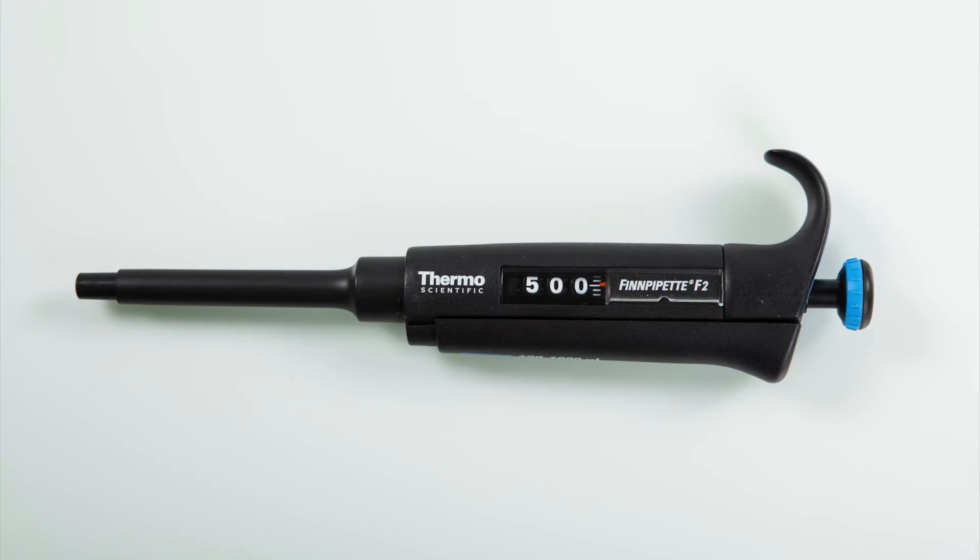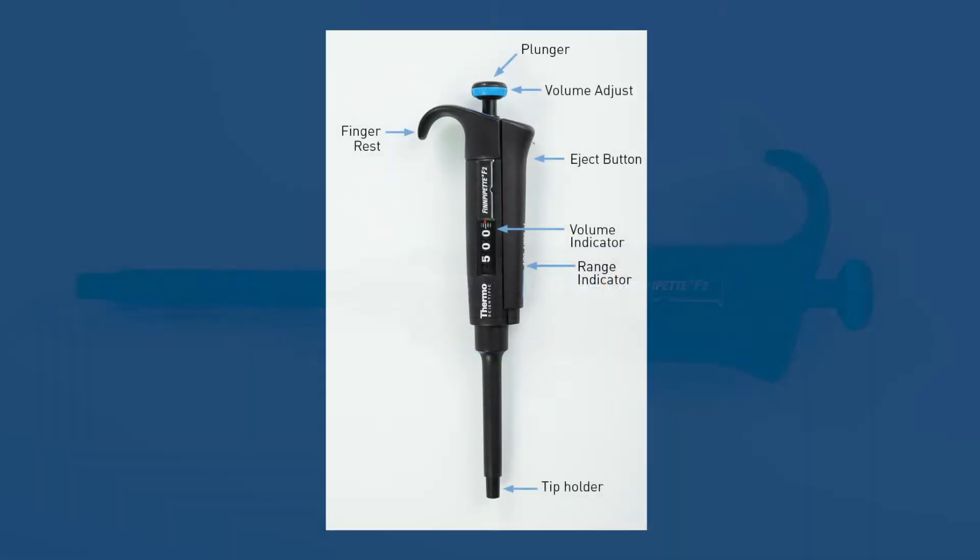Being able to recognize the parts of the pipette is important. This is a commonly used pipette brand at Sanford Research. The pipette you use may be a different brand and may look slightly different, but it should have these basic parts.